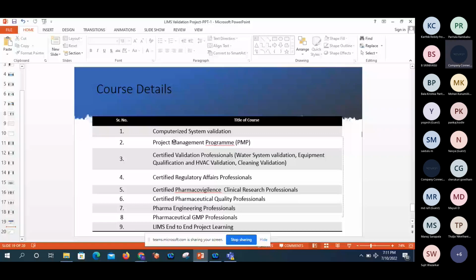Here I also want to add something before releasing the systems. Once you have completed your validations of any software, whether it's a LIMS or any other software, after release of the software there is a time period called the hypercare period. During the hypercare period, the vendor will take care of everything very carefully. After that, the vendor will hand over everything to the operation team or to the pharmaceutical industry.